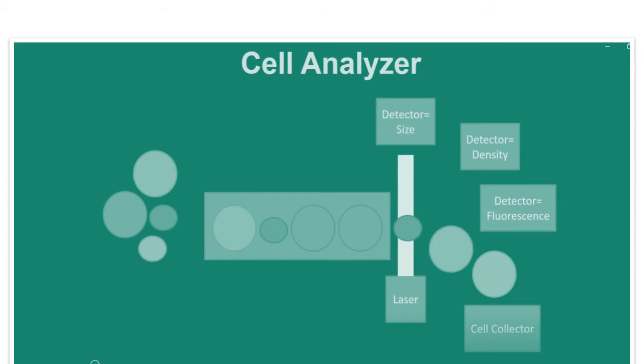And then at the end, you also require a cell collector. In case you want to collect these particular cells for further analysis, there is a funnel kind of thing that can be used to collect these cells. So this is the basic instrument design.